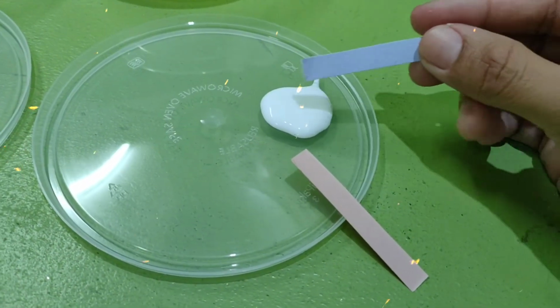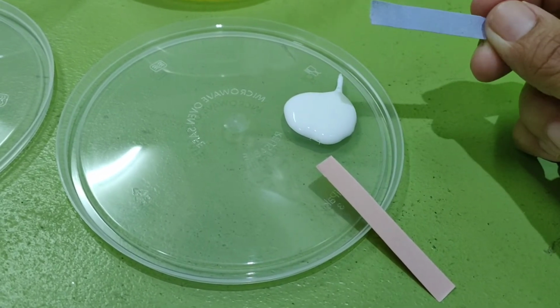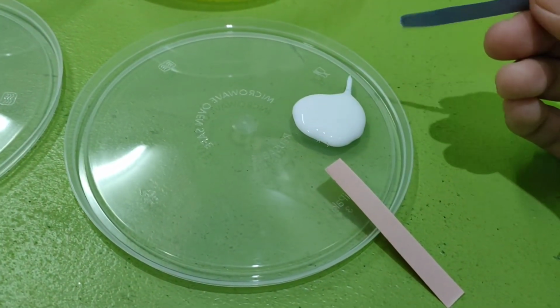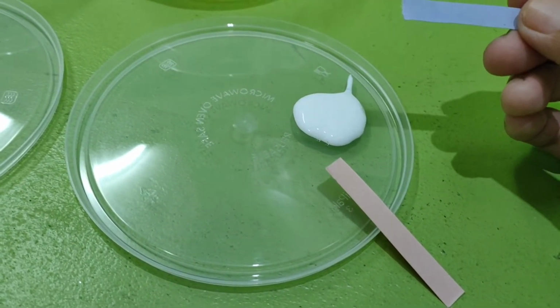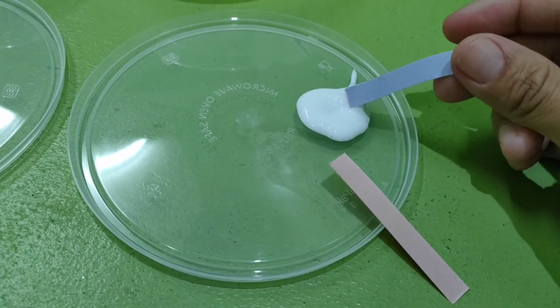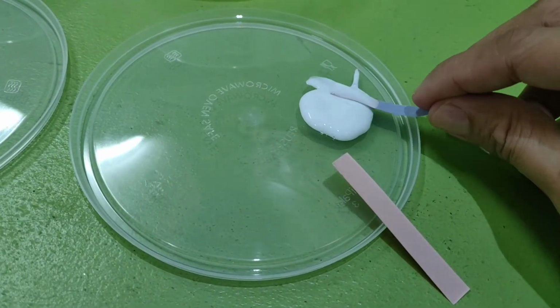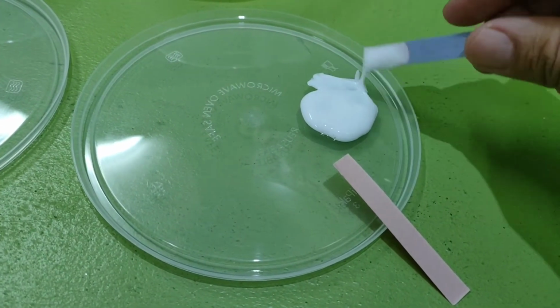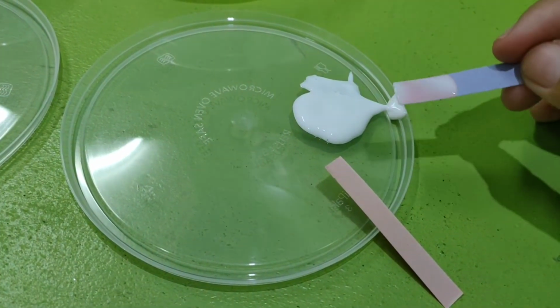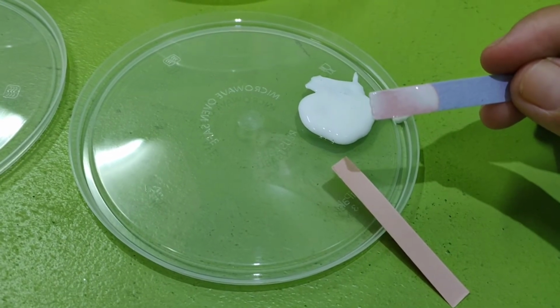So first, this is what we call glue. Okay, so Elmer's glue. So i-check natin yung Elmer's glue kung ito ba ay isang halimbawa ng base or acid. Okay, we will check. Okay, so makikita nyo, ang kulay blue na litmus paper ay nagiging red.